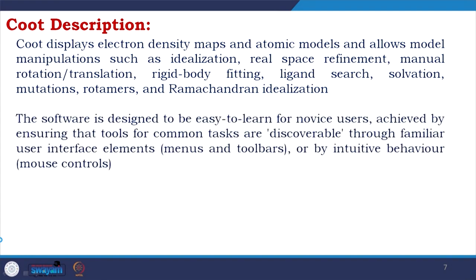The software is designed to be easy to learn for novice users, achieved by ensuring that tools for common tasks are discoverable through familiar user interface elements, menus and toolbars, or by intuitive behavior like using the mouse. So, this is very important, and it is also applied to any of the visualization software, especially to Coot and all, which help you to do manipulation.